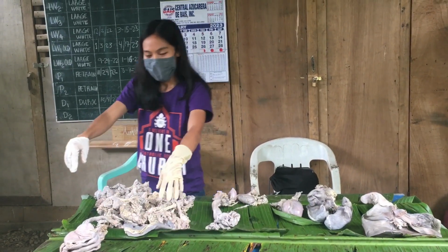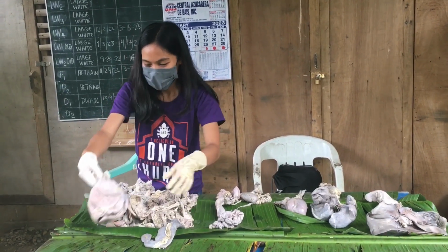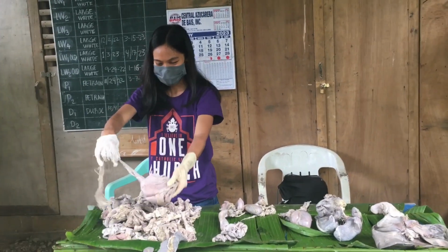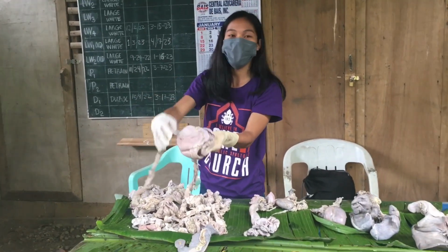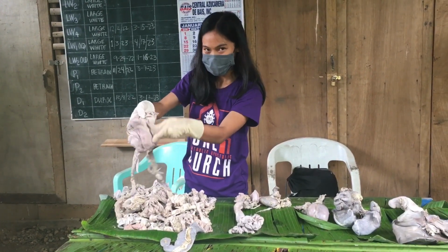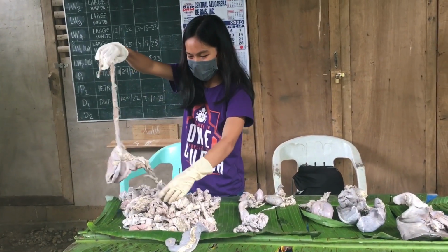We are now down here to the digestive system, or the parts or the organs of the digestive system. This is what we call the stomach. This is where the food gets in. And those tiny lines there, these are the intestines, the small and then the large intestine, but this one is the stomach. It looks actually like a pocket. This one is already cut in half because we are trying to identify it.